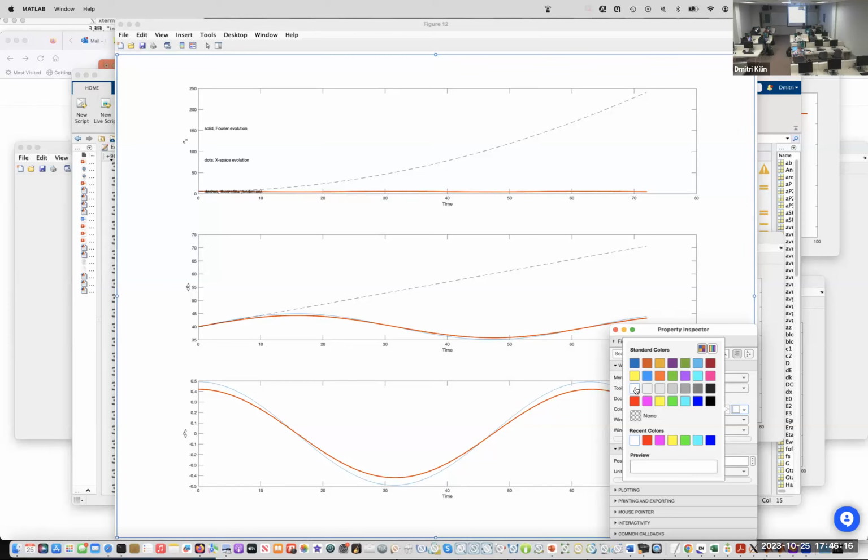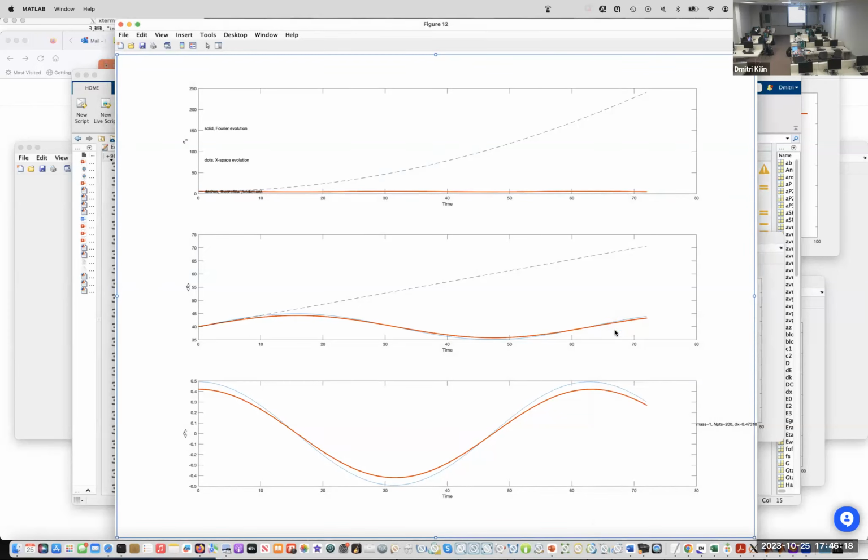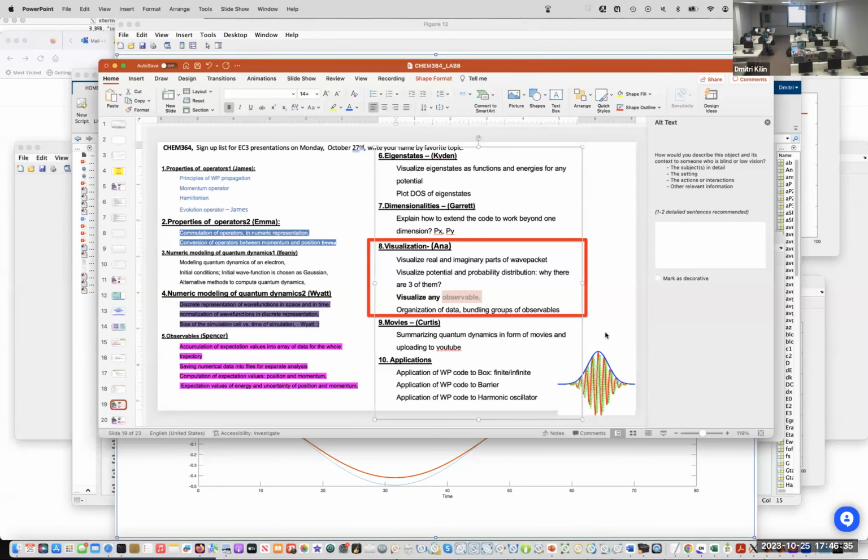Well, there are many little tricks, and the data can be saved into files and then plotted with your favorite plotter like Origin or Excel, but MATLAB gives competitive quality of figures. Okay, Anna, any questions about this subject?